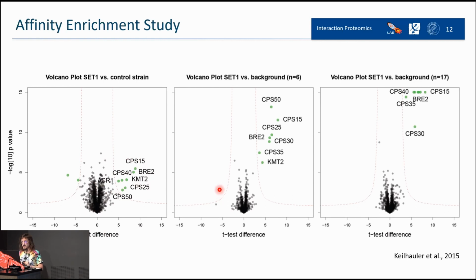Instead, they tried to use more data. So let's say that now the background is 6 different other conditions. As you can see here, the unspecific binders remain there more or less, because they don't change. They are always there in every condition. While for the specific ones, the log fold change didn't change, but the p-value changed, because now we have more data, so the p-value is reduced.